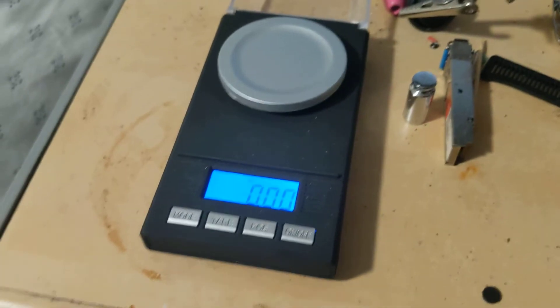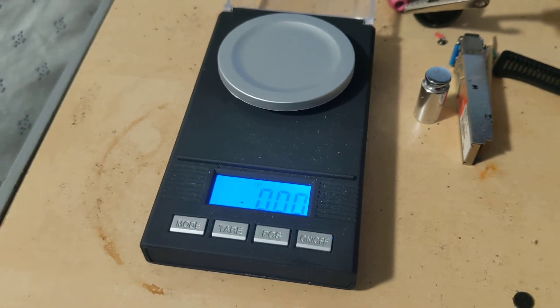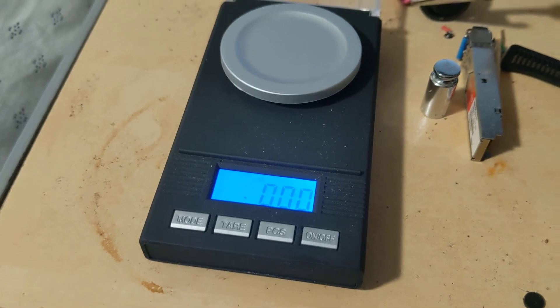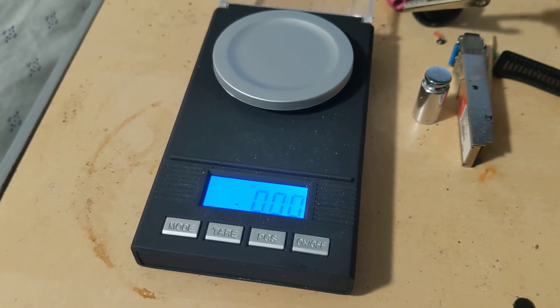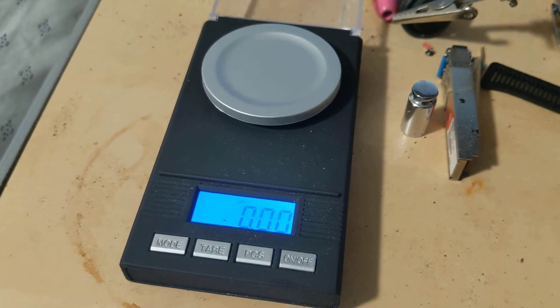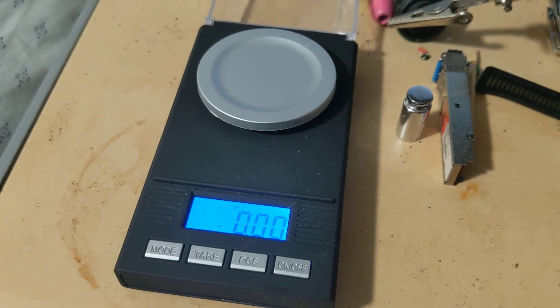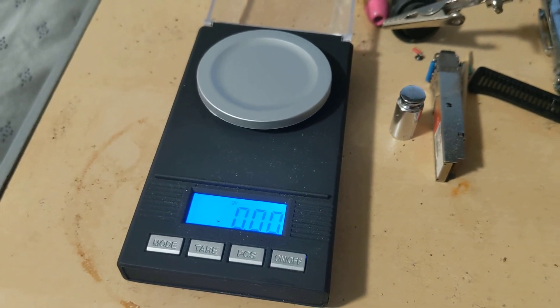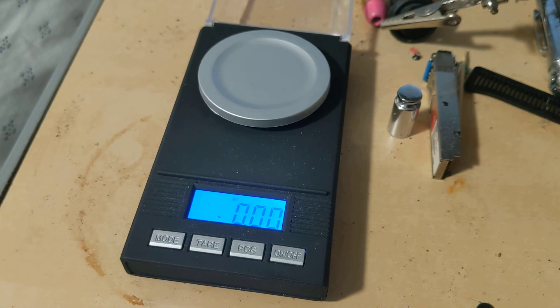Now I'm going to tear into this little thing. It seems to be okay. It's going to auto-zero and auto shut off and drive me crazy. It was 15 bucks shipped from China, and I like this a lot better than the other double-zero Waboos. I'm going to rip the sensor out and see how it is outside of the box. Talk to you guys soon. Bye-bye now.